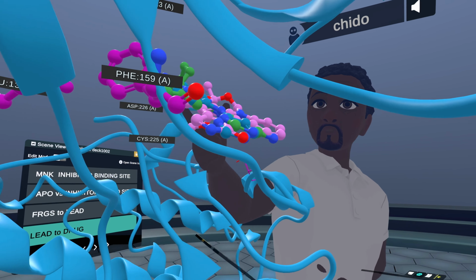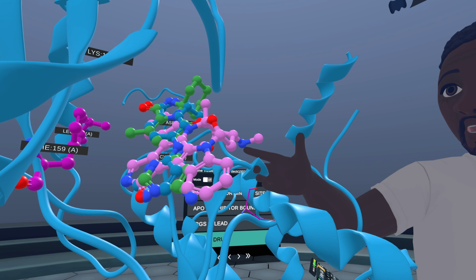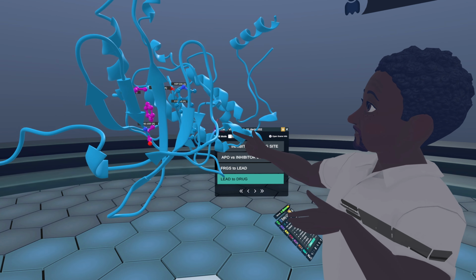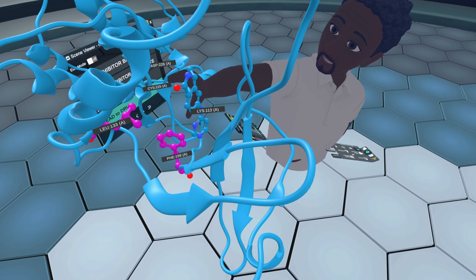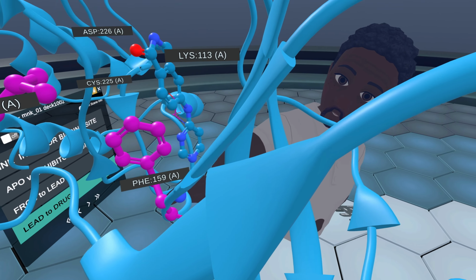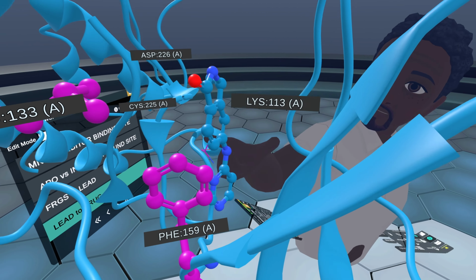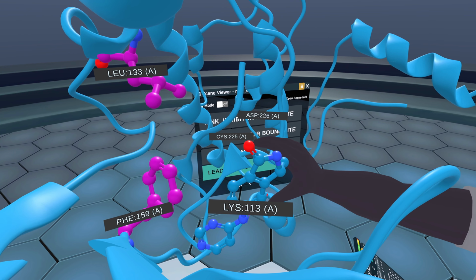These small molecules are much smaller in terms of their properties, in terms of the size. But let me just undisplay Staurosporine so you can see what we're looking at. Before, when we were talking about this, there's this fragment here. This fragment actually sits in the same region as Staurosporine, forming only one hinge region interaction with this nitrogen. You can see where I'm pointing my finger here, sticking this towards where the DFD loop is.